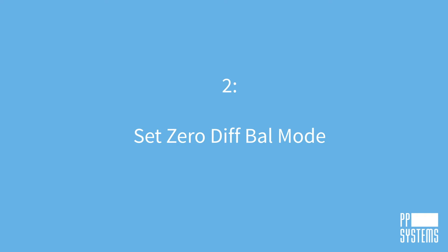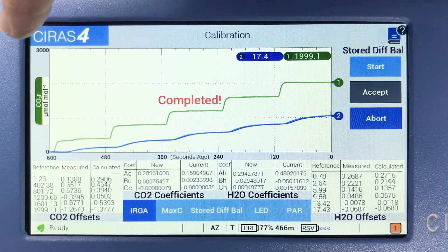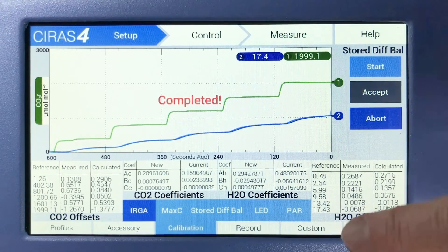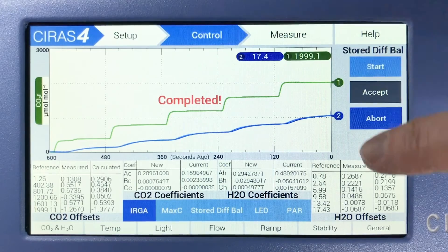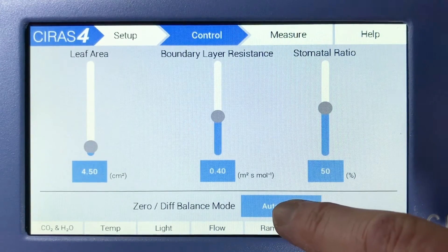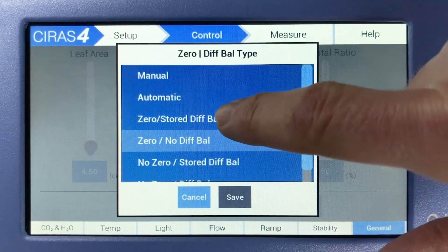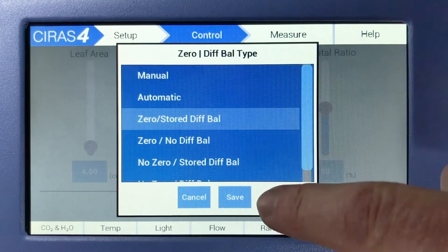Next, let's set Zero DIF-BAL mode. Navigate to Control, General. Tap the Zero DIF-BAL mode button, select Zero Stored DIF-BAL, and Save.